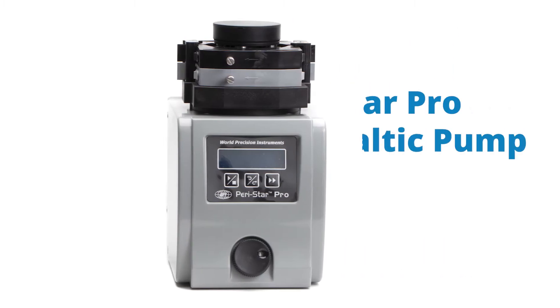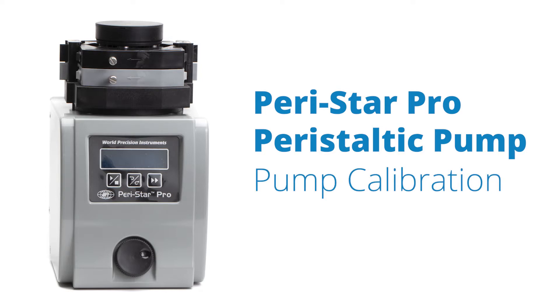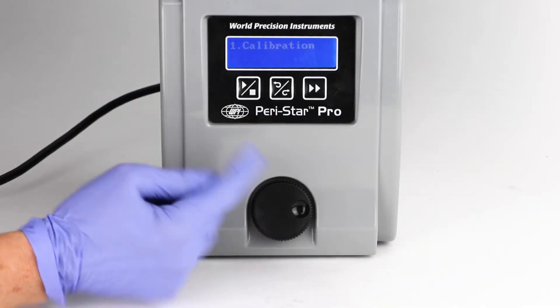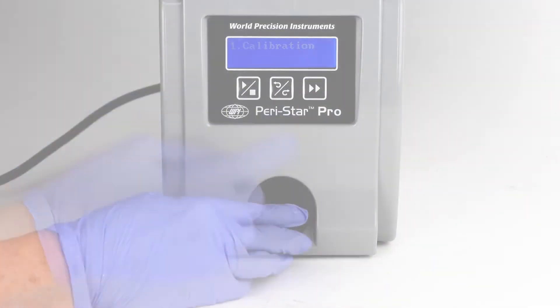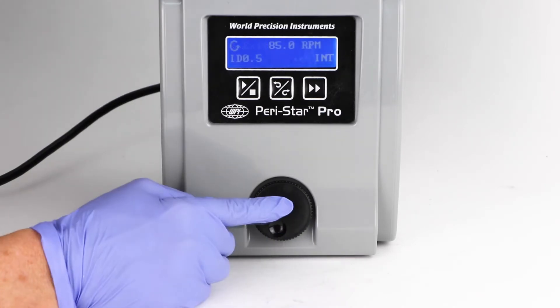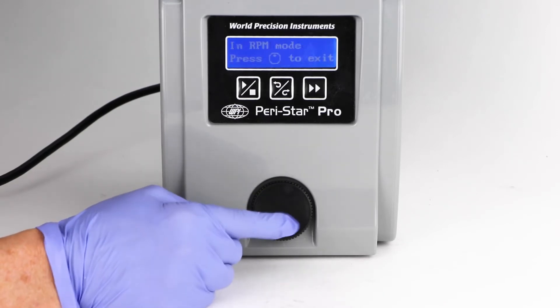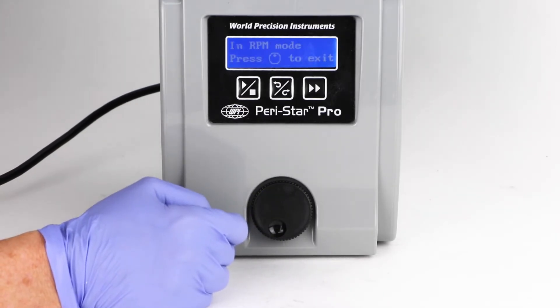The Peristar Pro is a popular peristaltic pump. Here we see how to calibrate the pump. Press the control knob to enter the setup mode in the main menu, then rotate the control knob to switch between the four functions. Click the control knob to activate a selected function, and the LCD display shows the corresponding menu.